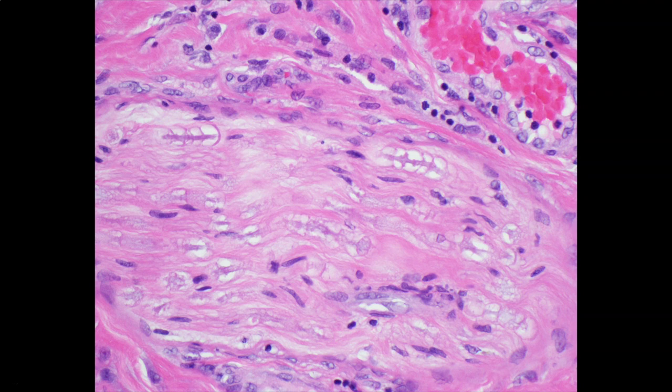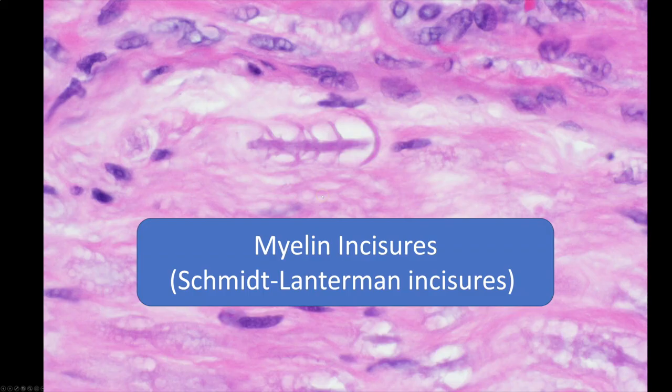All of those things are lipid-based and they dissolve. This only really works in bigger nerves — the tiny nerves in the dermis don't usually have much myelin. But seeing the axon with myelin around it is a nice way to recognize nerve. Now look at these funny little striped lines — they almost look like a spine with little ribs coming off of it. I initially assumed these were nodes of Ranvier, but those are actually too small to see with light microscopy. Friends on Twitter pointed out that these are actually called myelin incisures, or Schmidt-Lanterman incisures if you like eponyms.